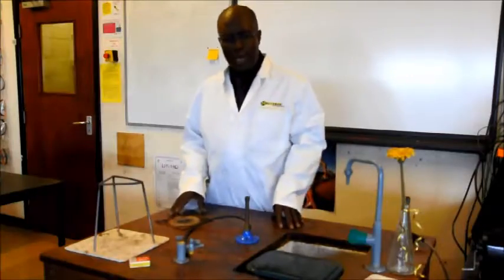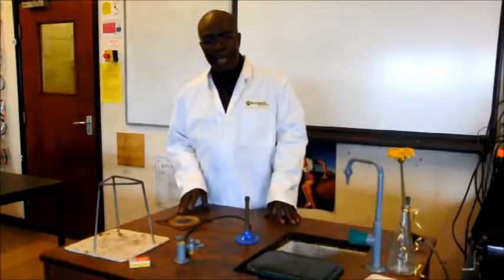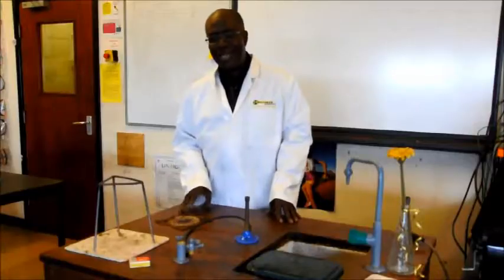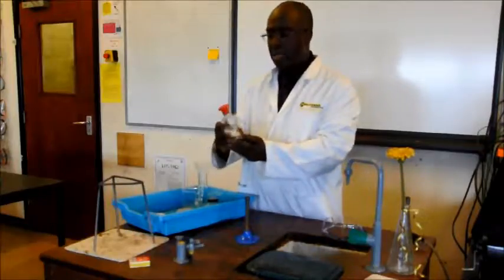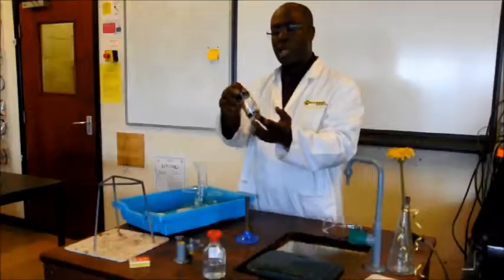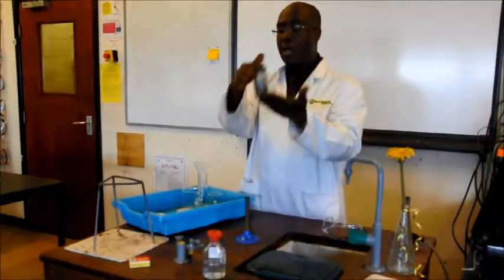This is the AQA required practical in the preparation of salts. We'll actually make copper sulfate starting with sulfuric acid and copper oxide. We'll require some dilute sulfuric acid and copper oxide. This is the black powder, and this will react to give us our copper sulfate.